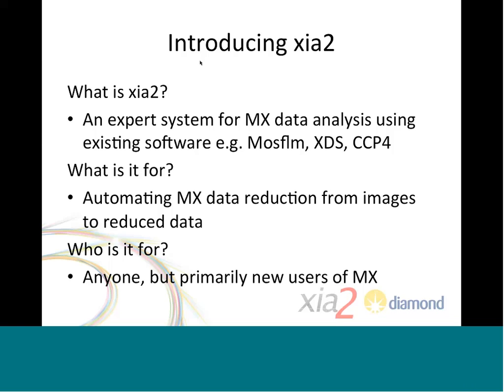Now, it was written originally to support the eHTPX project to allow remote operation of data processing. It is particularly useful to new users of MX who just want to use it as an analysis tool as part of their biology, but the tool itself is pretty much useful for everybody. I have a wide range of users.